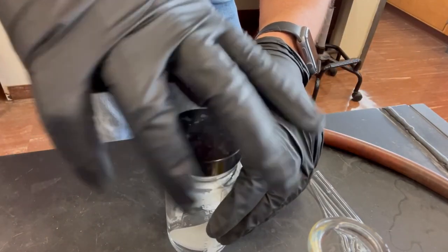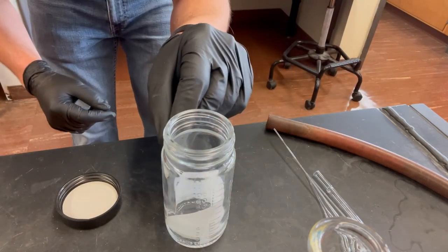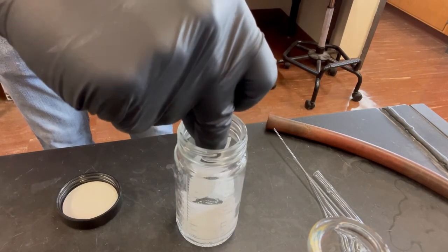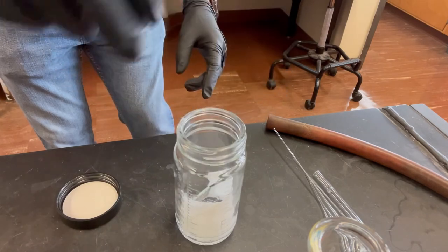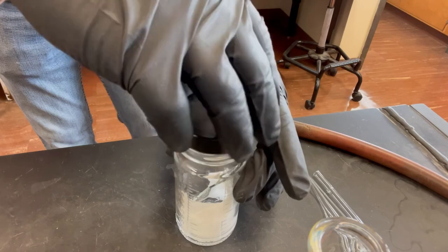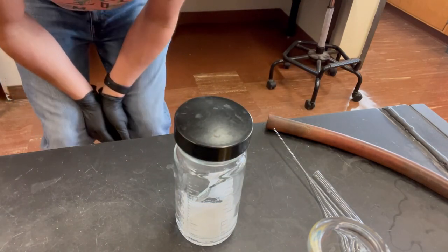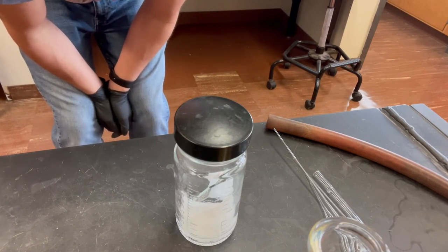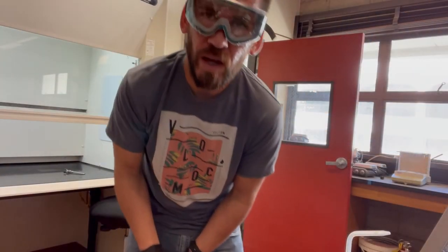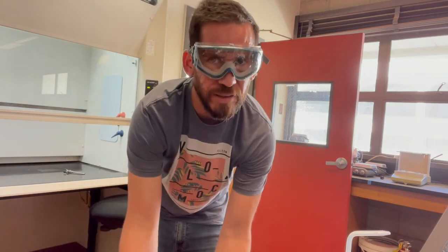We're going to go ahead and place this in here. Make sure, hopefully, our volume is good. We'll place that in here, and we're off to the races. I'm going to go ahead and cap that. And it's running, super sonic.